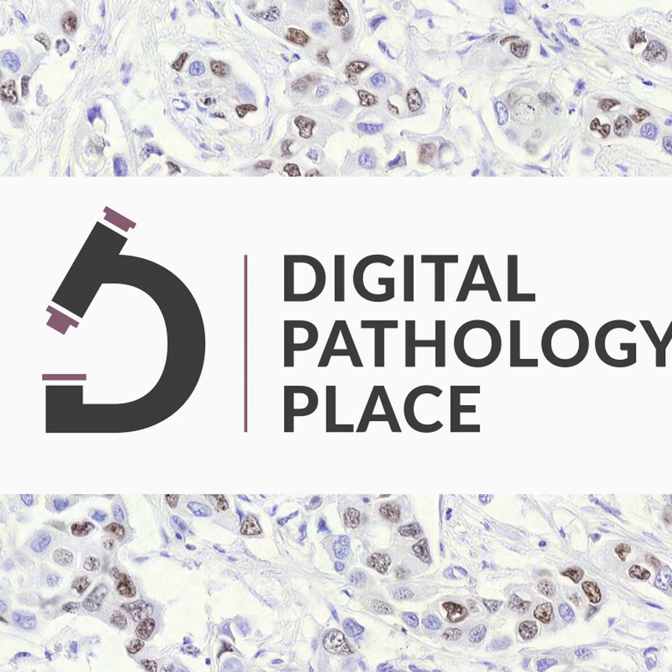And regarding image analysis skills, we already mentioned a couple of steps that maybe were not necessary when the multiplex was not so high-plex, like data visualization. Is the barrier to entry for a person starting with phenotyping now higher, or how do we approach this? Sure.